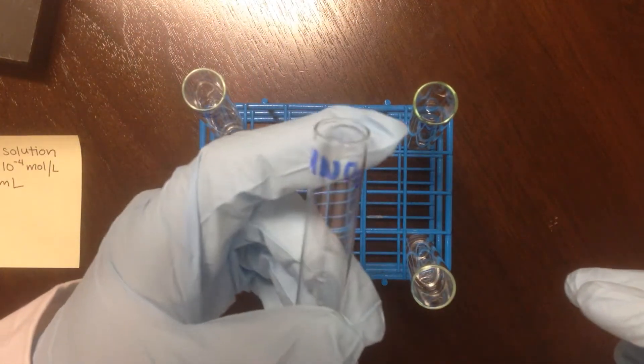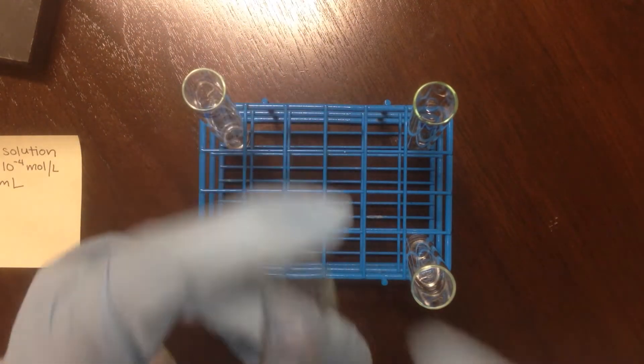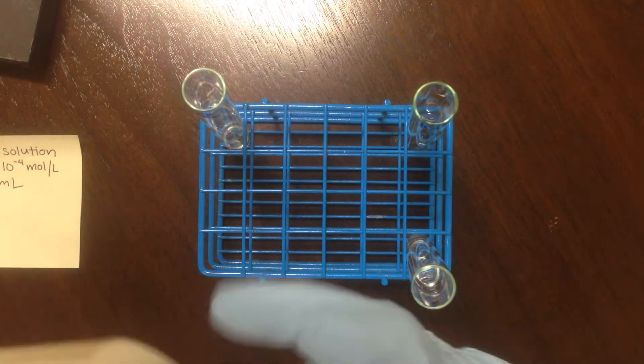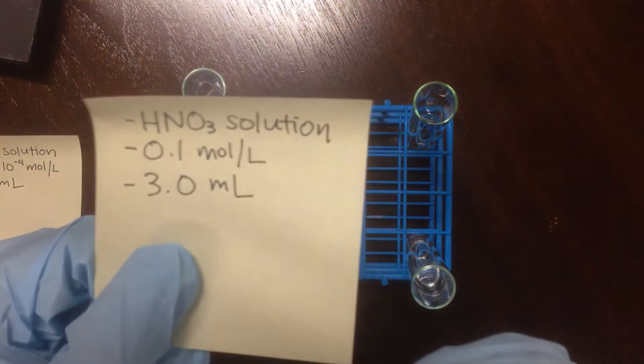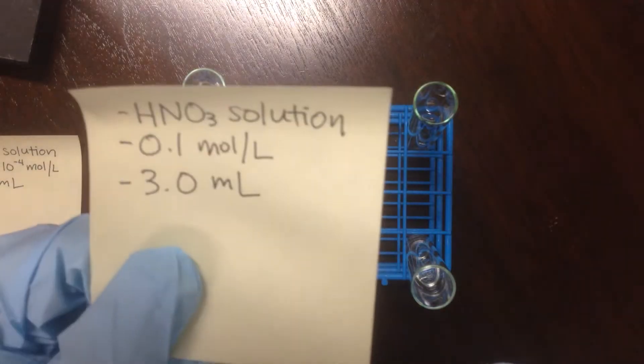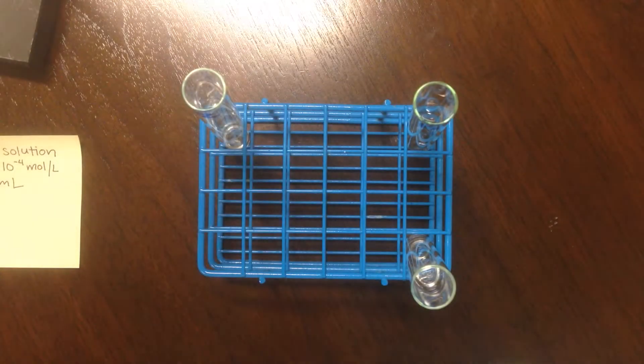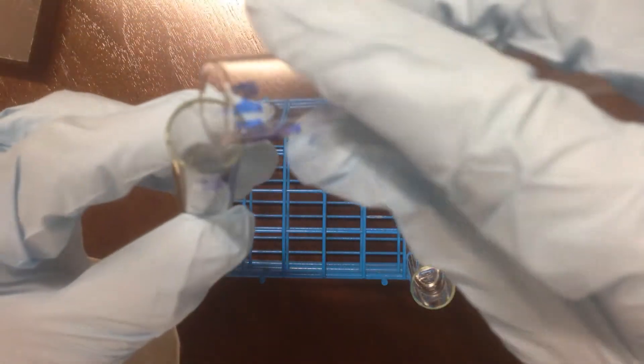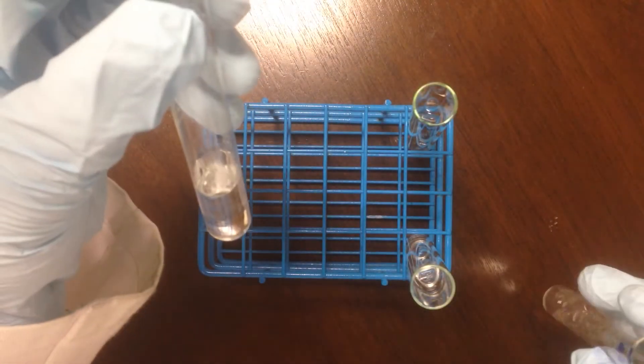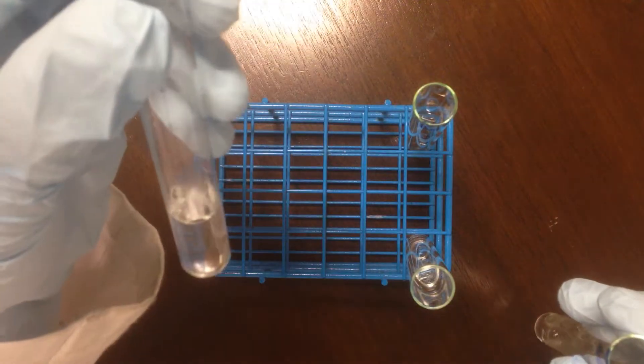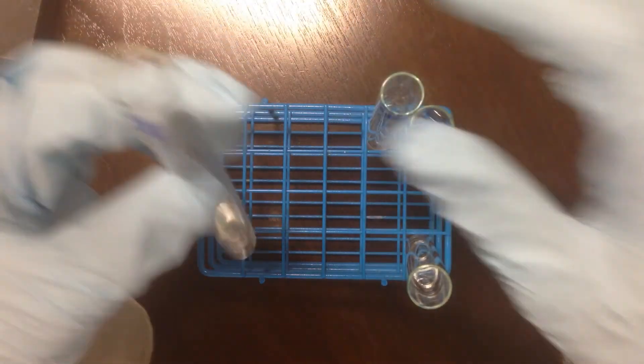Next is the nitric acid solution, HNO₃. This is the stock nitric acid that you'll use in lab, and it is 0.1 moles per liter. This tube contains 3 milliliters of the nitric. When I add this in, no real color change yet. It's still for the most part colorless, maybe a little bit of pale yellow there.